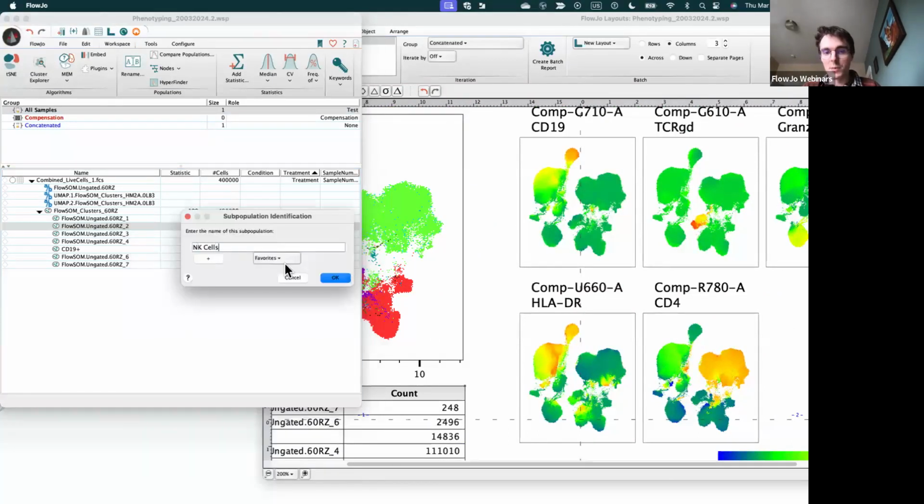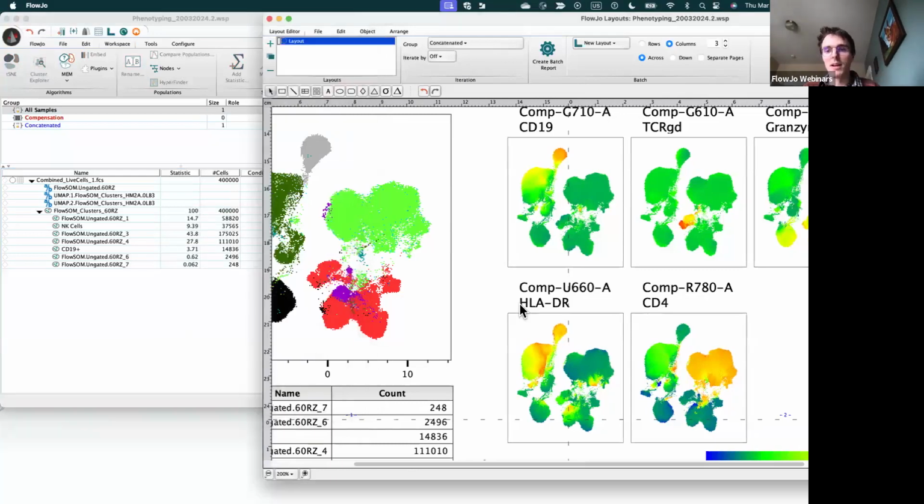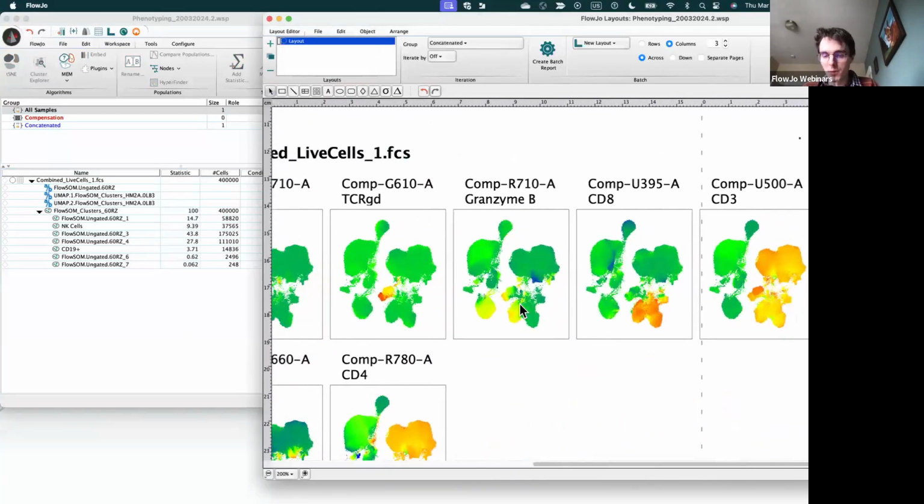And I should note, as we're going along with this phenotyping webinar, we have a lot of immunologists who work here at FlowJo, but I'm not really one of them. I come from a bioinformatics background more so. I'm a data scientist. So some of my phenotypes I'm going to call very generally. And I know that we have very specific definitions that are often debated about some of the phenotypes.